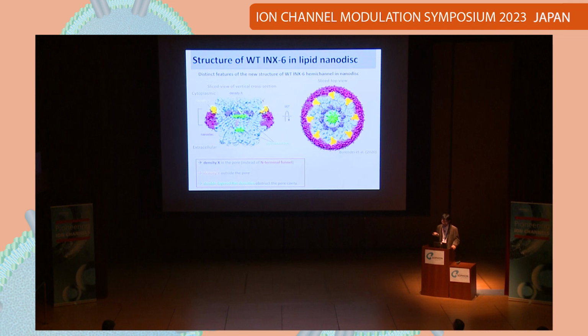So we assumed this could be the partially resolved head group of the phospholipids. However, all these newly observed densities are too ambiguous to assign the atomic model. So we obtained another two structures by cryo-EM.